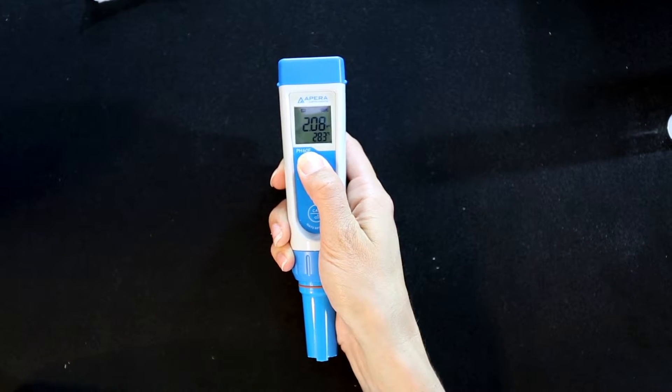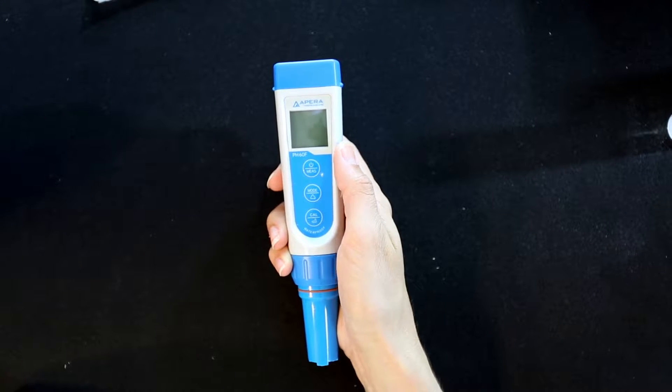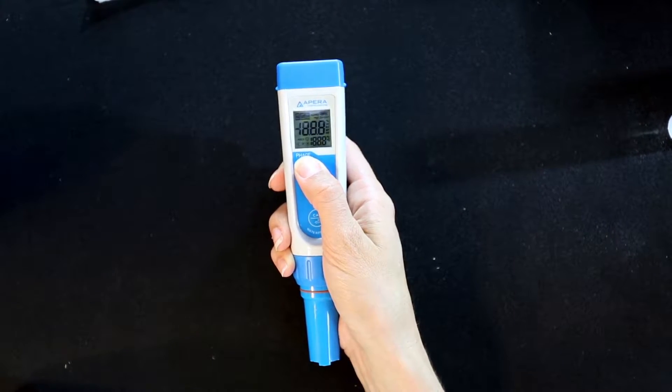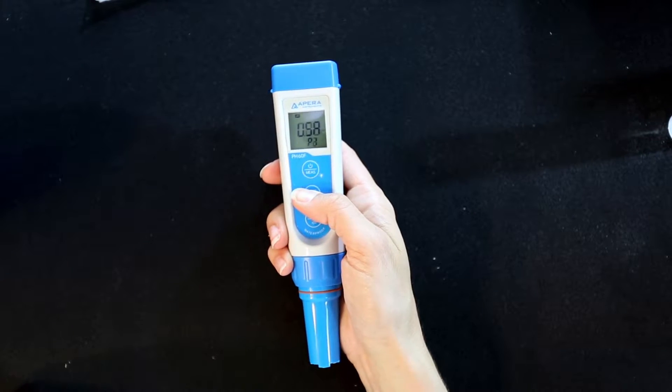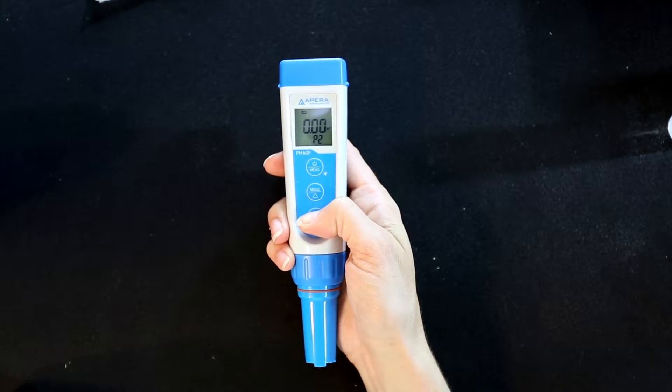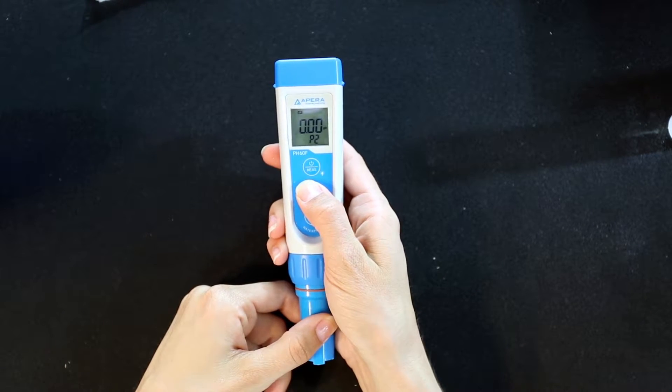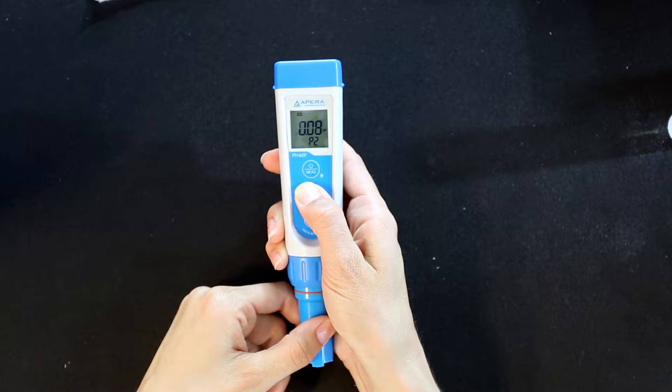Long press the power button to turn off the meter. When turned off, long press the power button again to enter the setup menu. Press the arrow button to select parameters. When in P2 or P3, press the enter button and when it flashes, hold the arrow button to adjust values.